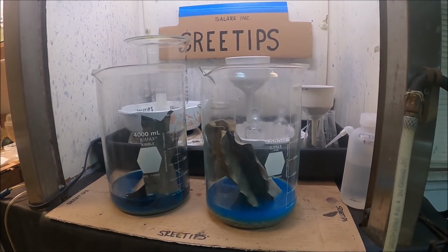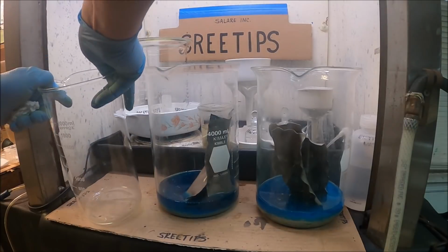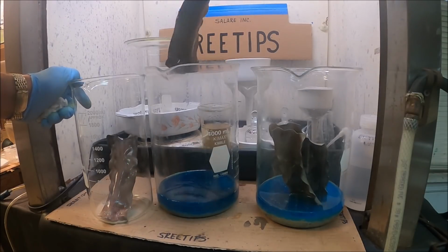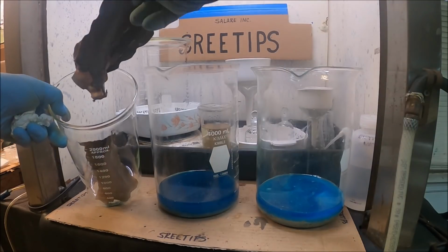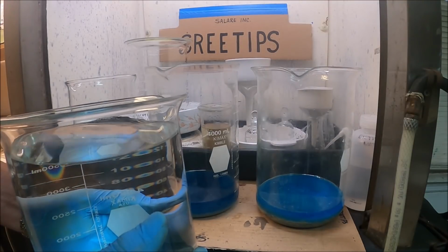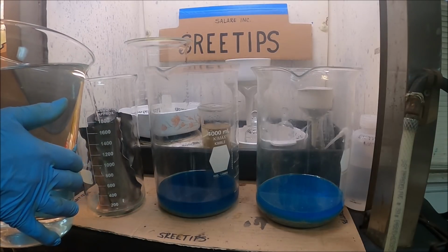Now what we want to do is get these pieces of copper out of here, and I'm going to put them right in another beaker. Still chunky pieces of copper that we can use to cement more silver out from other silver solutions. And then what I do is I don't leave the copper exposed to the air. I fill it full of water here. This is distilled rinse water that came from my silver cell clean out. It's gonna have a little bit of silver in it.